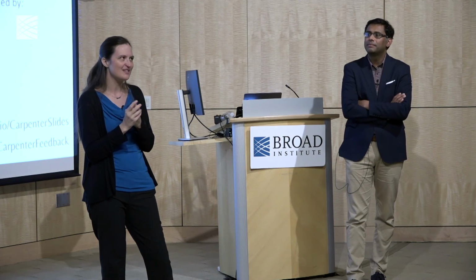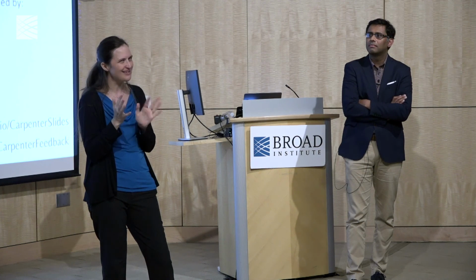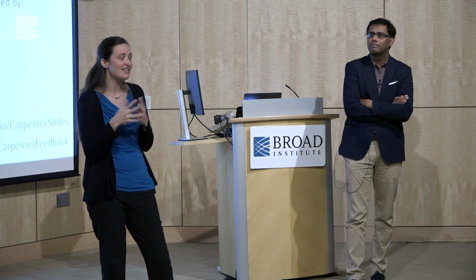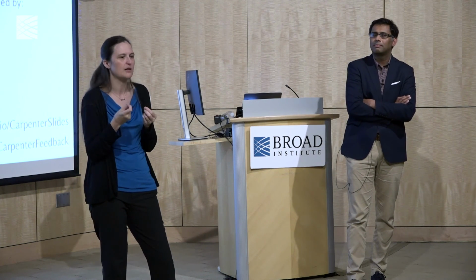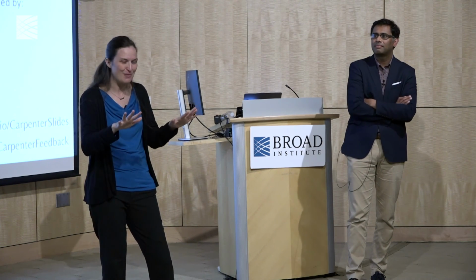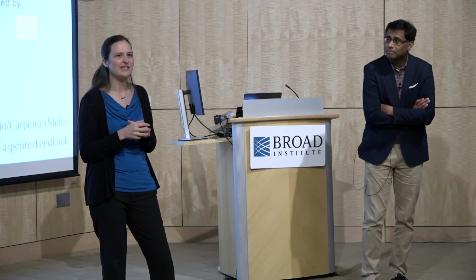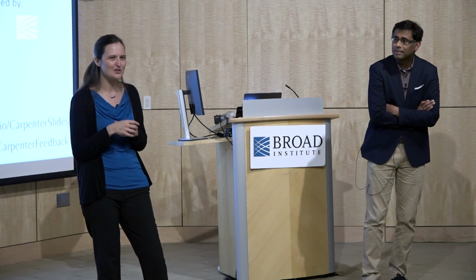So it's a little harder to say, but if I had to guess, it's probably more than half the time it's not so discernible to the eye. And partly that's not because we can't see the thing, but more because of just the statistics. It's two heterogeneous populations that differ just slightly. It's statistically detectable, but it's not the thing that our human brain is so great at capturing.